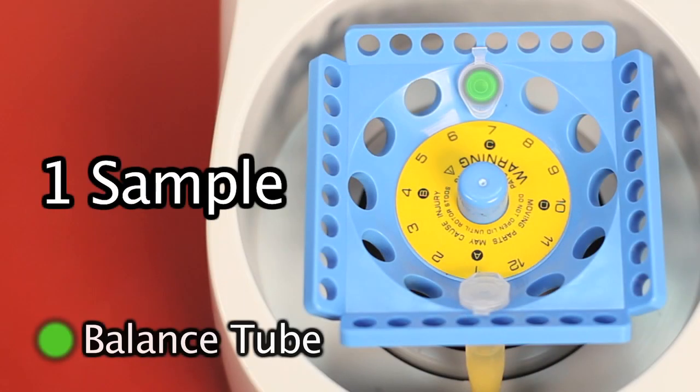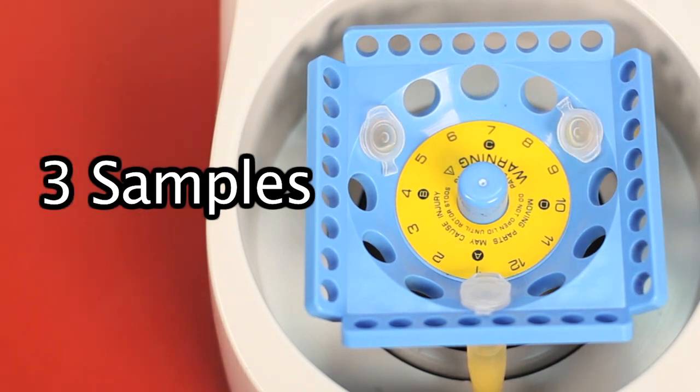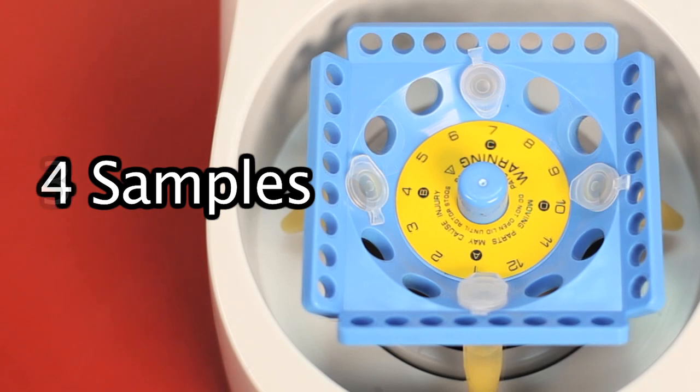Step 3. Balance your centrifuge by placing your microtubes and balance tubes opposite one another so as to evenly distribute the weight. Here are some examples of microtube combinations for a 12 configuration rotor.